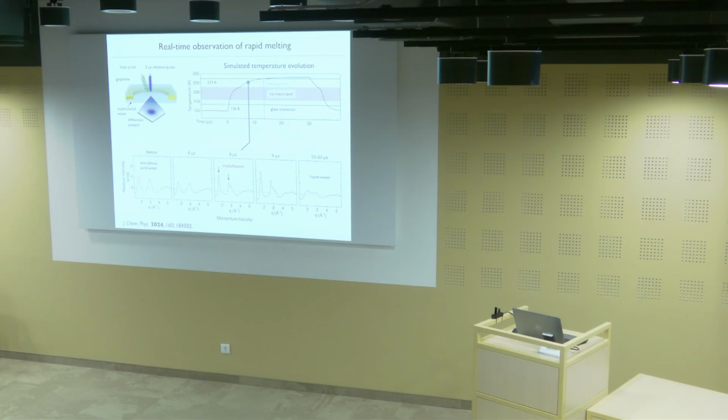And apparently, during the passage here, we've picked up some crystallites, which now grow larger. And this is why we see these diffraction features growing in. And then at 9 microseconds, these features get more intense as these crystals grow larger. And then finally, we cross the melting point here. And so then if we take a diffraction pattern here at long times, then again, we get the diffraction pattern of liquid water close to room temperature.